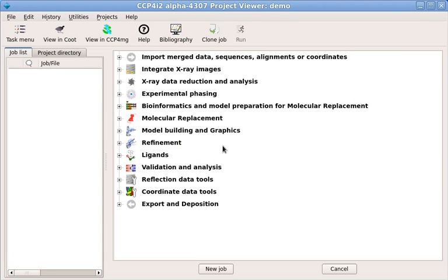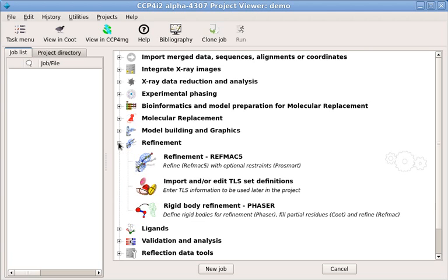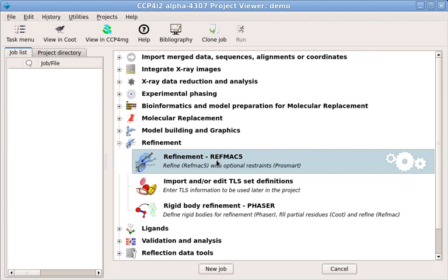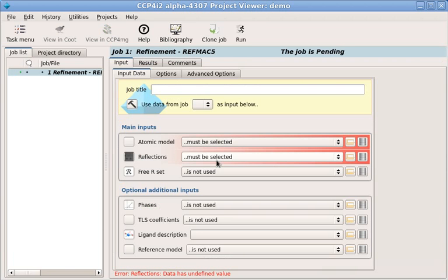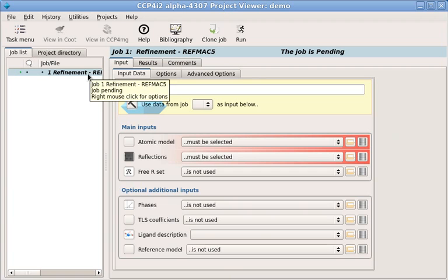Now we want to run a task. Let's try a refinement first. On the right is the task menu. You can get back to here by using the task menu icon. Open the refinement section and double click refinement with REFMAC5. The new job is shown in the job list on the left.